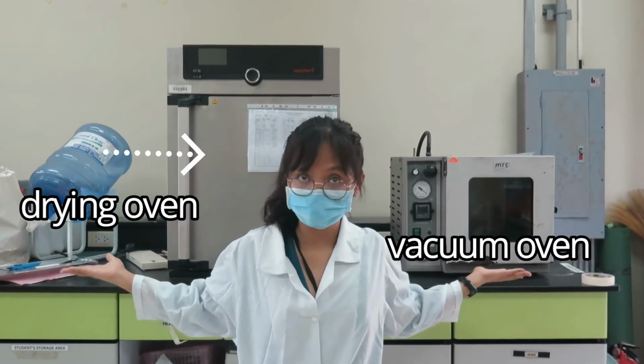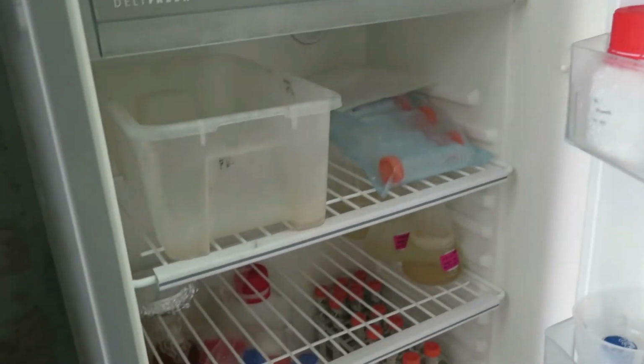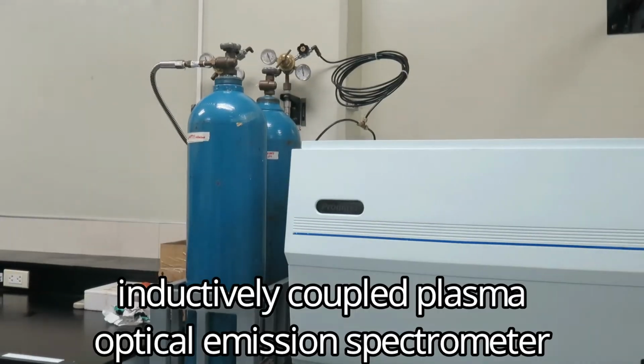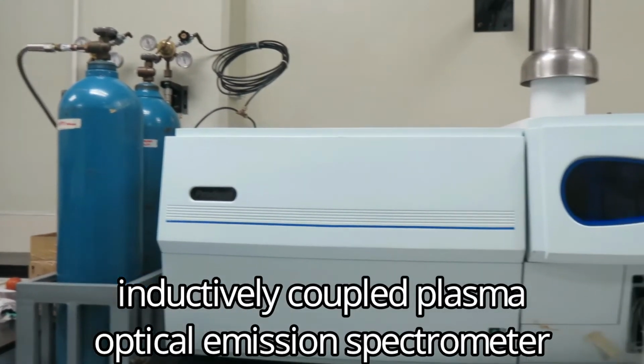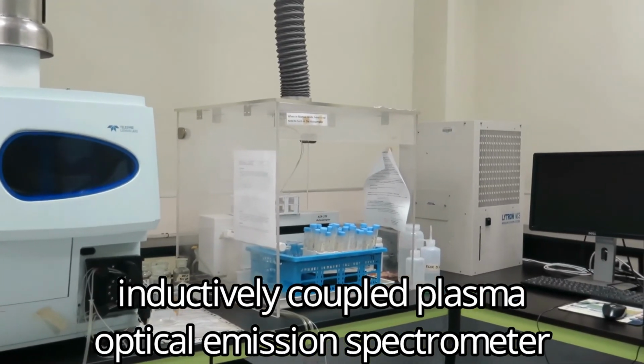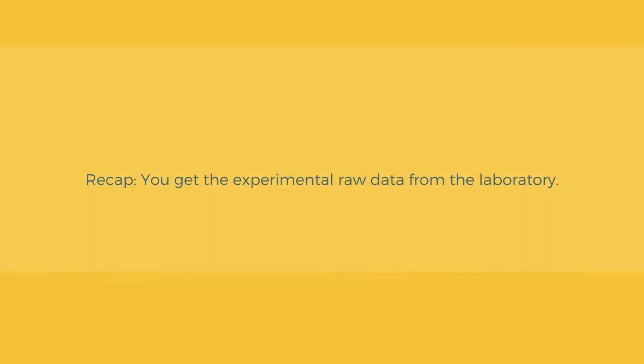Of course, it won't be complete without the drying oven and the vacuum oven for drying your samples. And of course, the refrigerator for cooling down your samples. Lastly, this is the ICP-OES. It is used to determine the elemental composition of a solution. Finally, we're done with the laboratory part where you get experimental raw data.